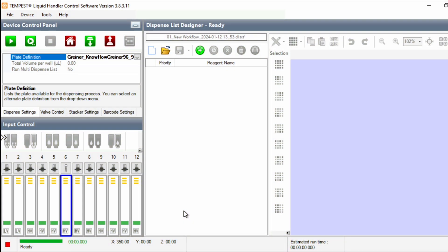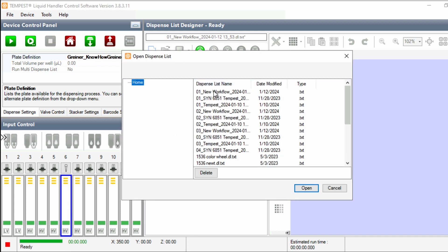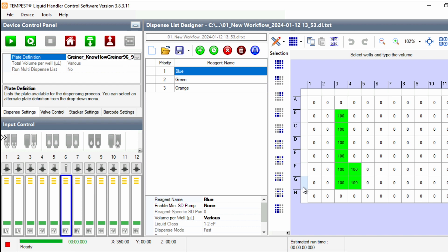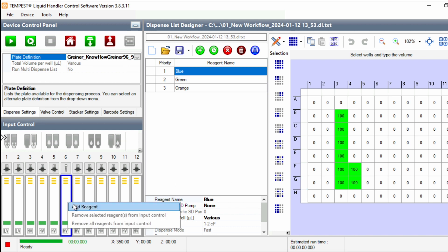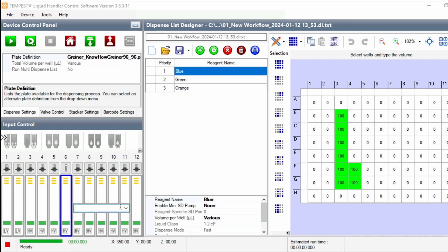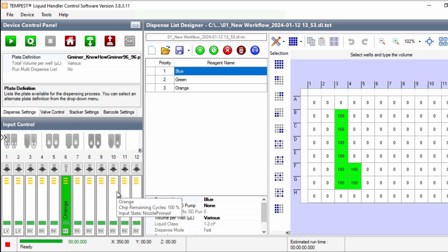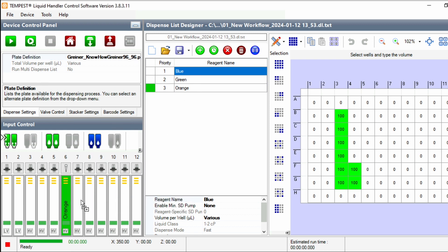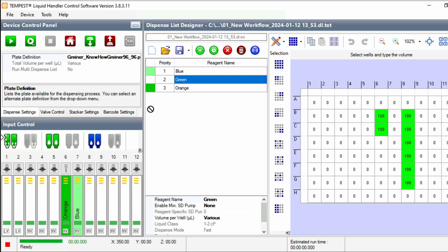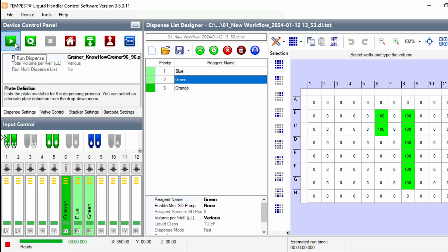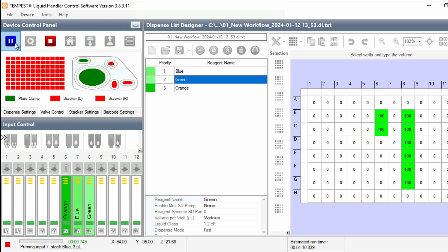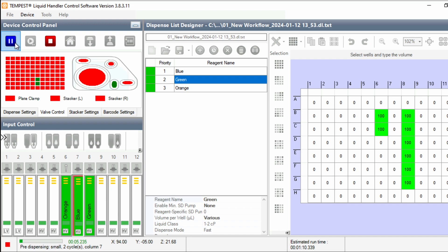To run a single dispense list onto one plate, load your dispense list by clicking the folder icon and selecting the correct file. You can then assign the liquids by right clicking on the chips in the Input Control section or by dragging and dropping the liquids from the reagent list. When the chips are assigned, press Play. You can then repeat this for every dispense list you want to use.